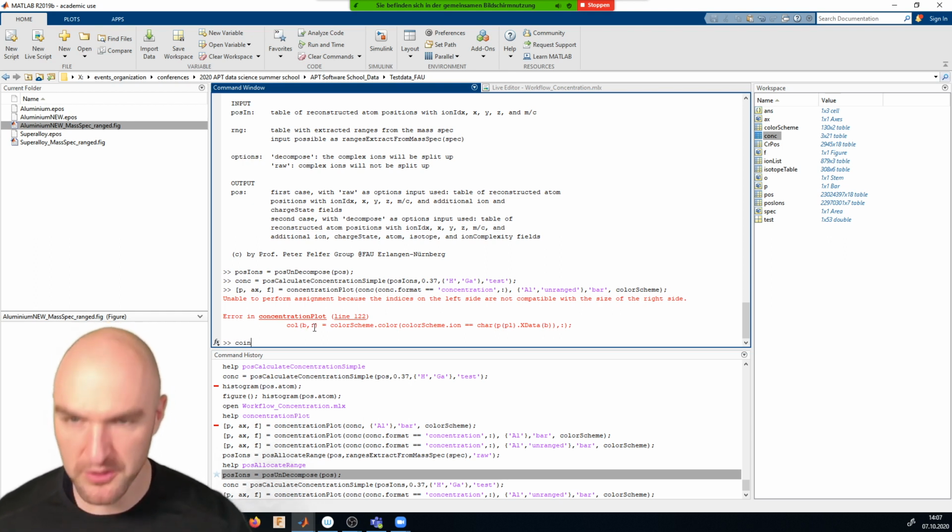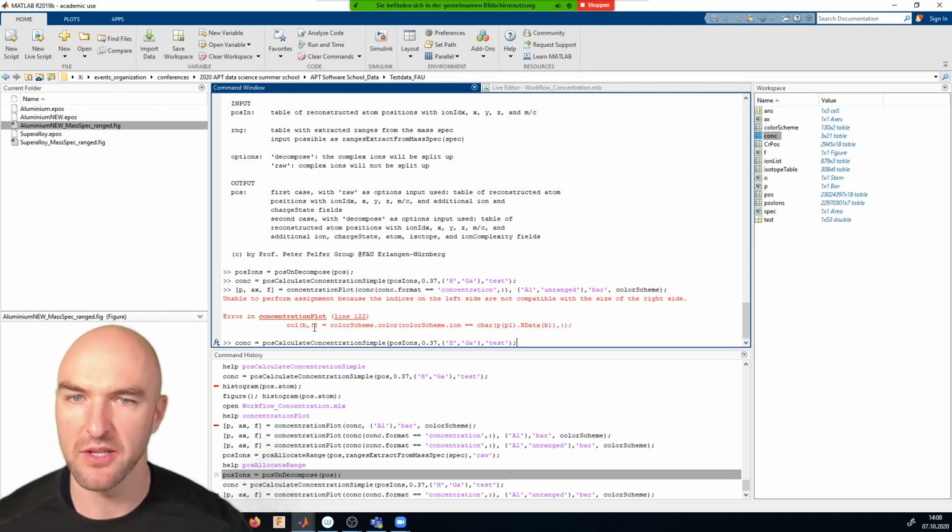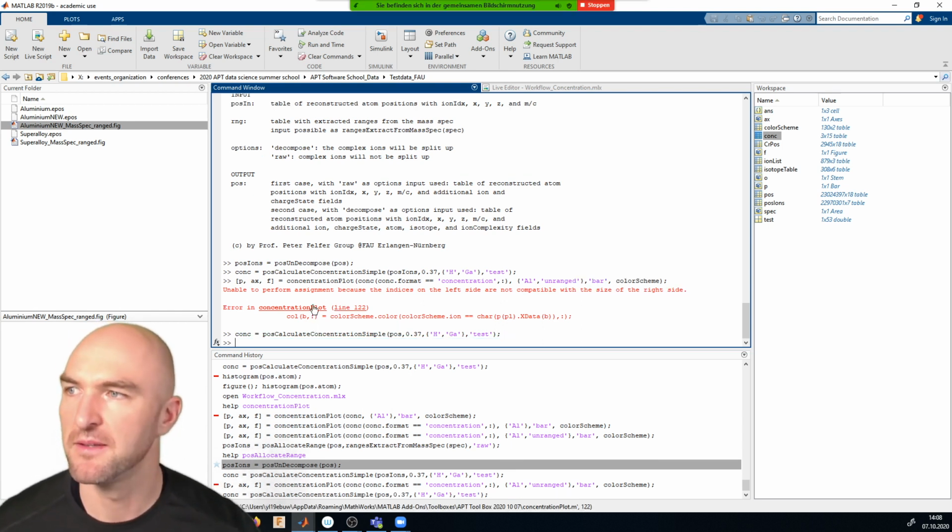Okay, I will just calculate everything then just for the regular decomposed pos file.